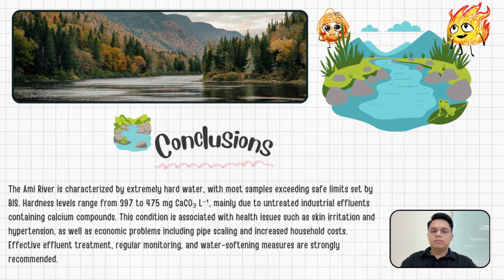To reduce this problem, proper treatment of the industrial waste, regular water quality monitoring, and the use of water softening methods are strongly recommended.